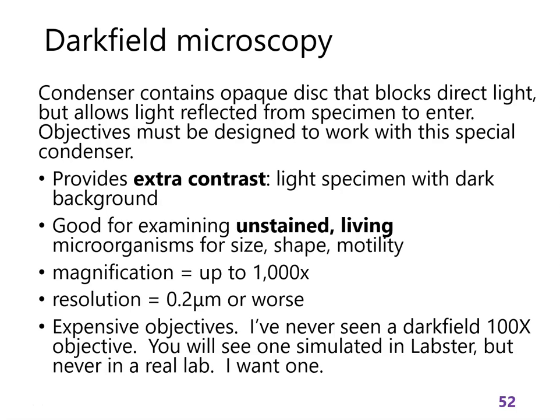Dark field microscopy is very different. It uses tricks to increase the contrast. So for dark field microscopy, the condenser has an opaque disc that blocks the light completely. So the only light you see is light that is bent by your sample. So you see a dark background with light specimens. So this is really useful if you're looking at living organisms that are big, algae, protists, and stuff.